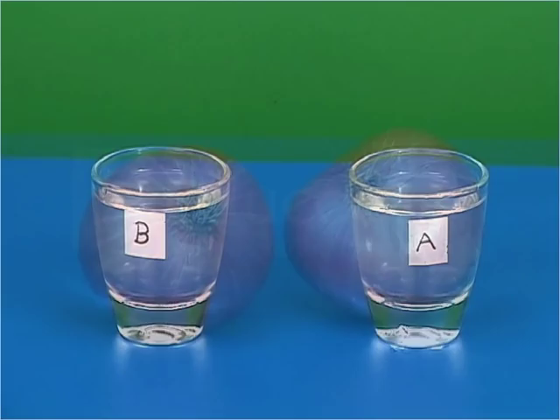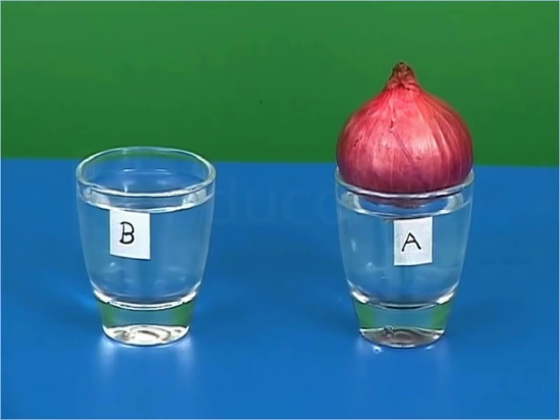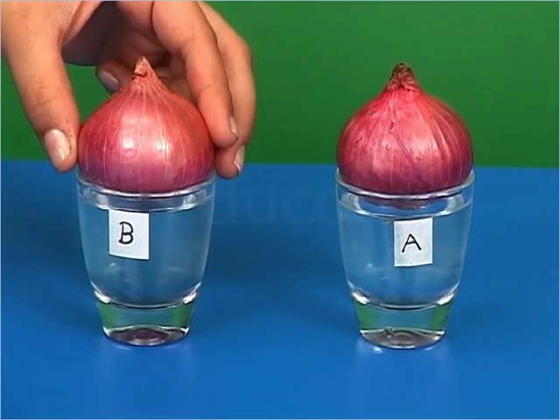Now take two onion bulbs of the same size and place one in each tumbler such that only the lower surface of the bulb is in contact with the water.